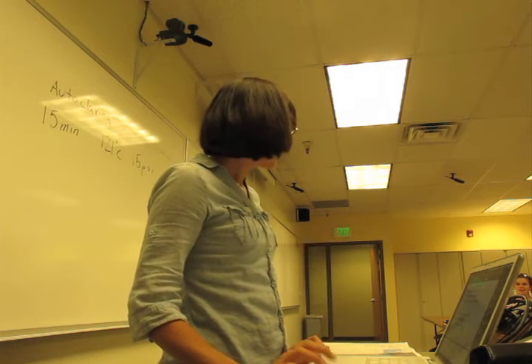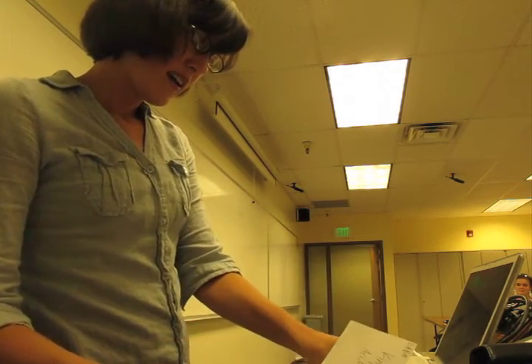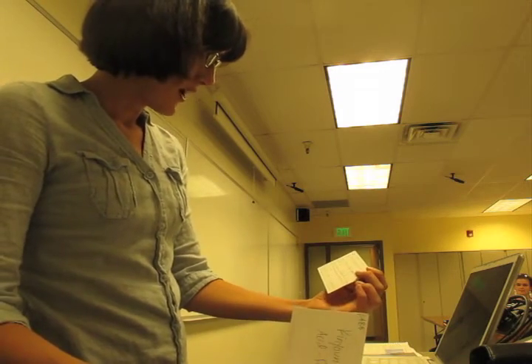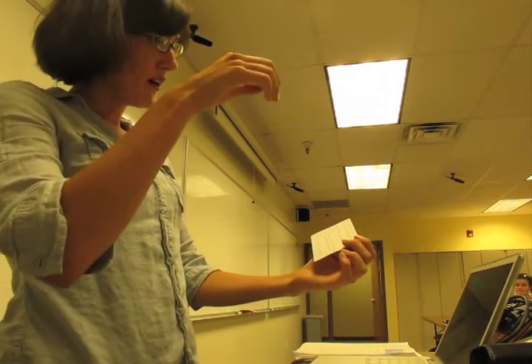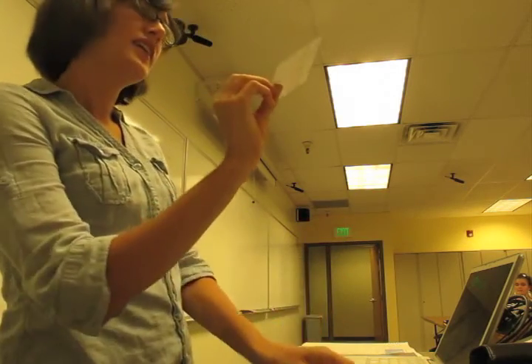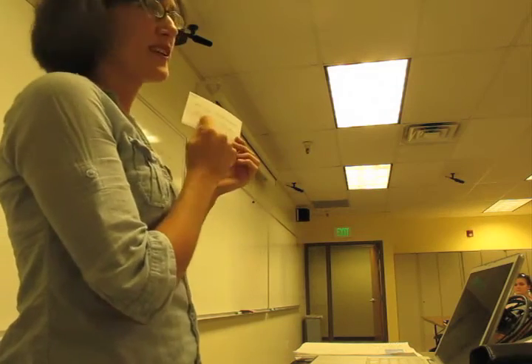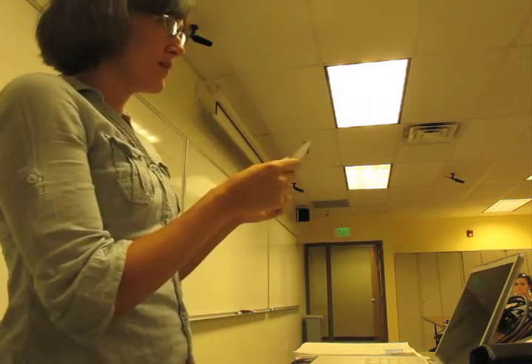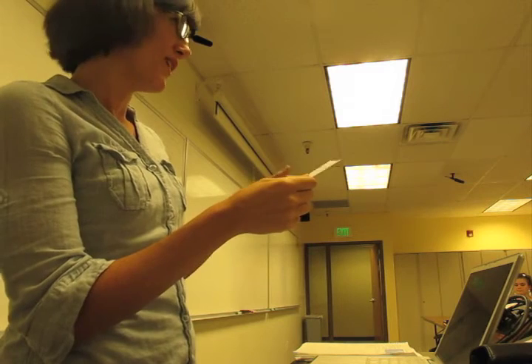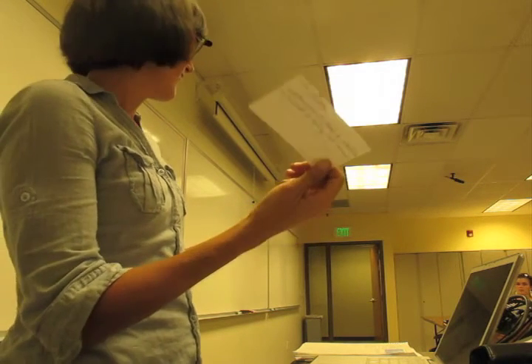Anything else you should mention about acid-fast staining? I feel like I'm missing something. Oh, in our book, it talks about how you would put the carbol fuchsin on and then heat it up. We didn't do that process. We did something called the Kinyoun modification, which is a cold stain. I don't think you're going to have to remember that name, but just remember we didn't heat up the carbol fuchsin in our lab. We just did the cold stain process.